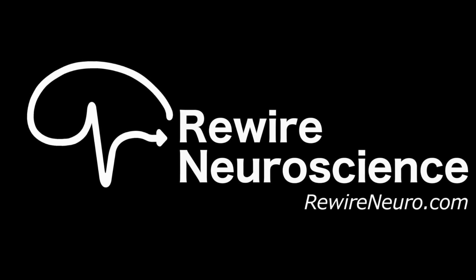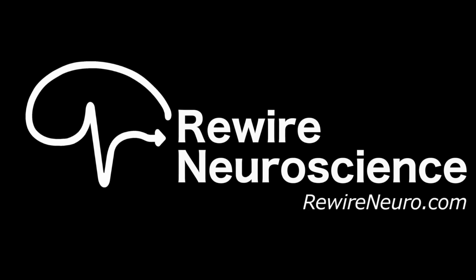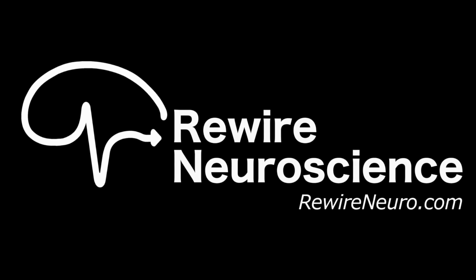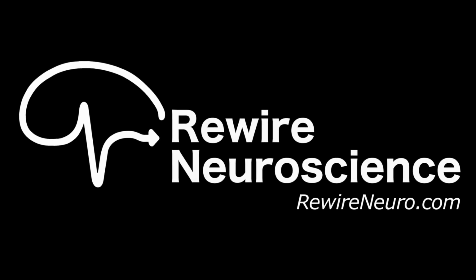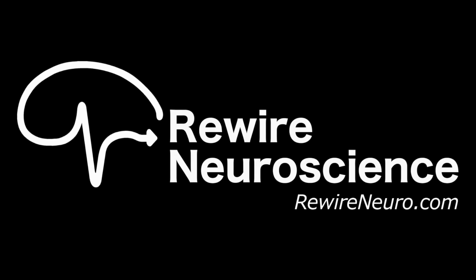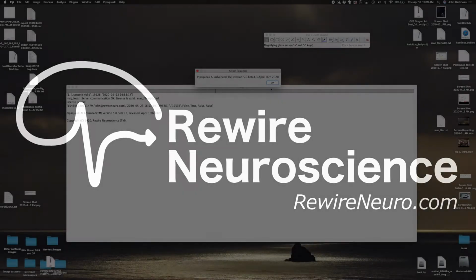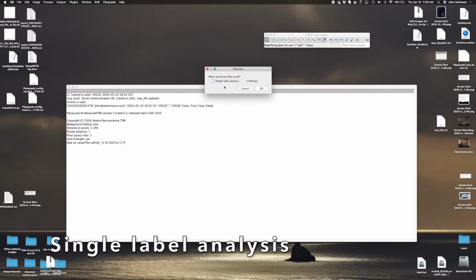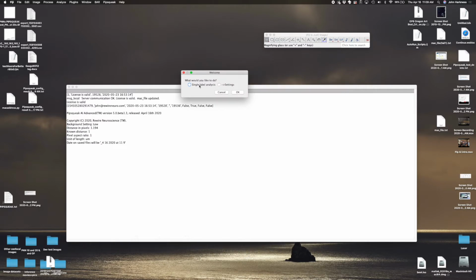Hey everyone, in this video I'm going to show you how to get going with Pipsqueak AI. At this point you should have already downloaded and installed both Fiji and Pipsqueak, and you should have already registered your username and license. We're going to look at how to analyze both parvalbumin and WFA in single label analysis mode. This video only looks at how to do single label analysis, but Pipsqueak is capable of both double and triple label analysis, which we'll walk through in another video.